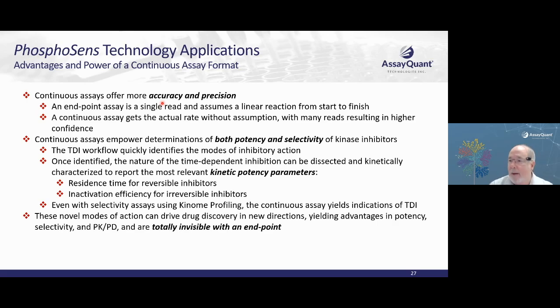And if you're trying to optimize a compound for this, you need to recognize that if you're using an endpoint assay, and we enzymologists have known this for some time, and we've been preaching this for a while, but the number of tools available to us hasn't been too big of a toolbox or too reliable of a toolbox. With our continuous assay format, you can see things that are totally invisible with the endpoint assay. Okay, so that's me stepping off my soapbox there, but I'm going to pass it back to Michelle.